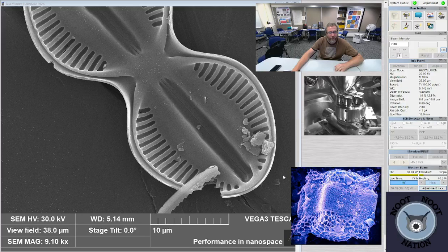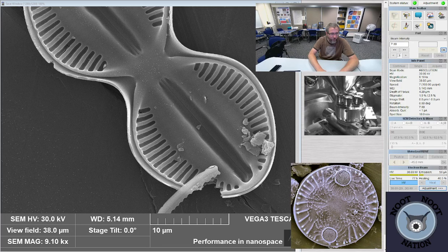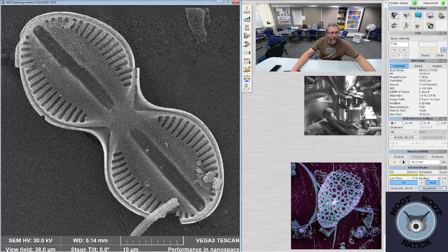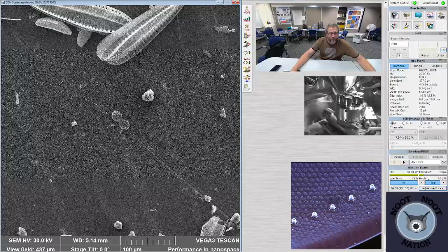This is Mountain Lake. I'm going to go up a level and make a new folder. Mountain Lake. And this is Diploneis of some kind. I think it's because they just have elevated salinity in this system. Whatever Mountain Lake is, I think it actually has slightly elevated salinity. And the reason I think that is, this thing is common in marine settings, or it could just be contaminated.